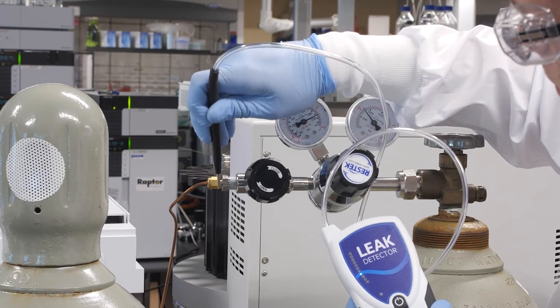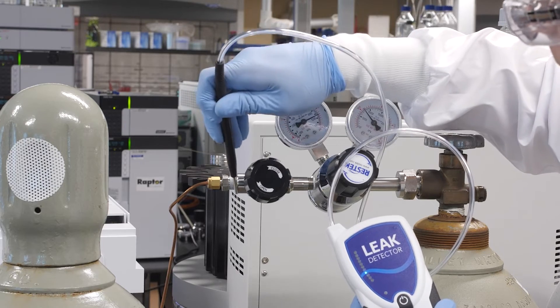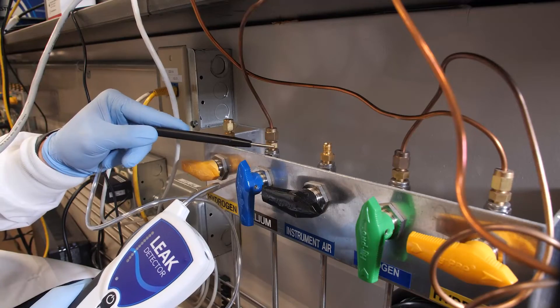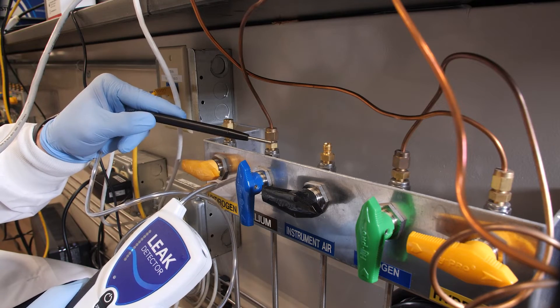When checking for leaks, it's important to use an electronic leak detector. Start at the beginning, the source, and work your way through the instrument to the detector.